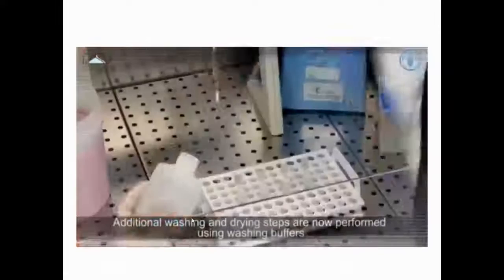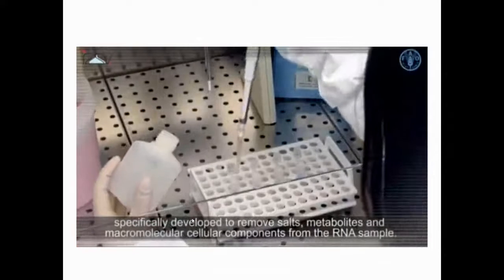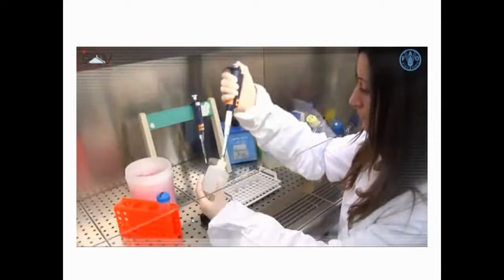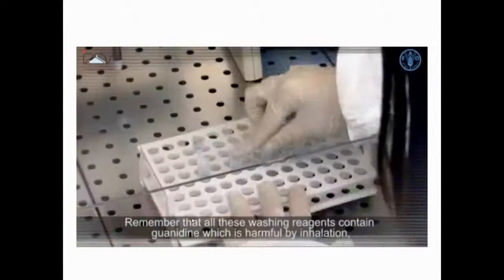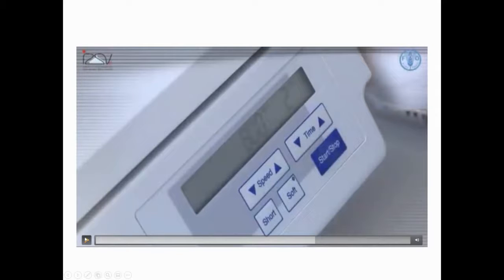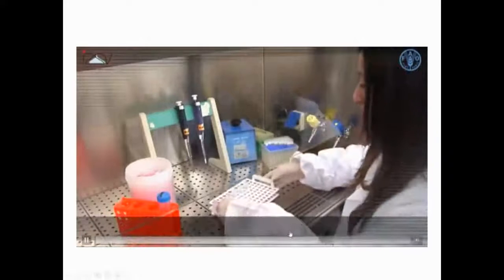Additional washing and drying steps are now performed using washing buffers specifically developed to remove salts, metabolites, and macromolecular cellular components from the RNA sample. Remember that all these washing reagents contain guanidine, which is harmful by inhalation, in contact with skin, and if swallowed. The guanidine is to inactivate the RNase activity. Okay, remember, after washing, RNA elution is now possible.